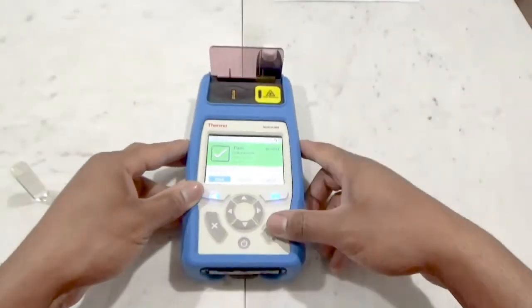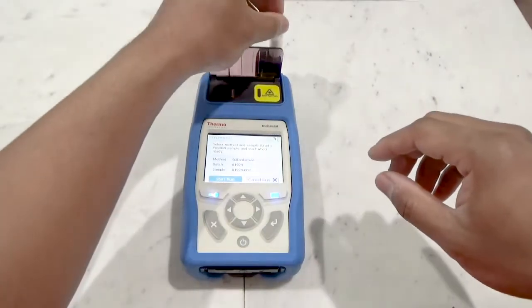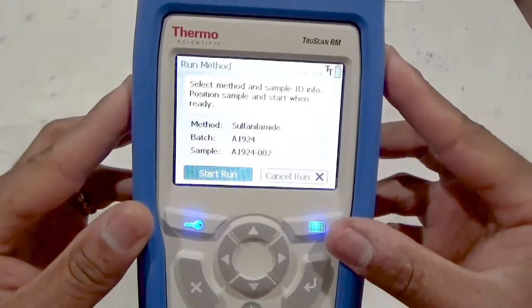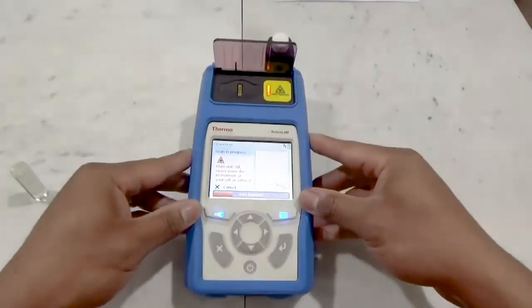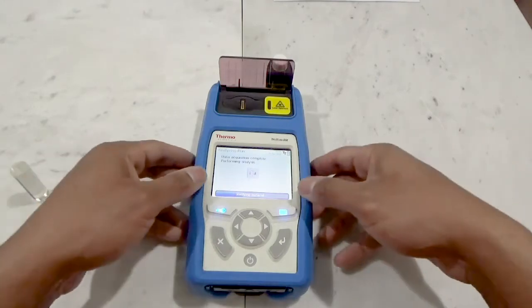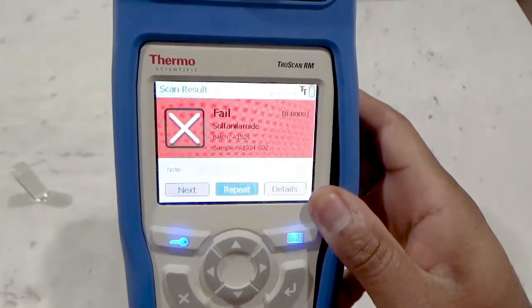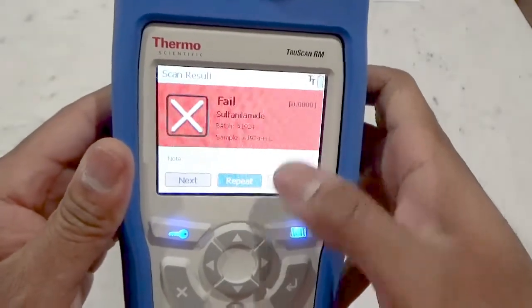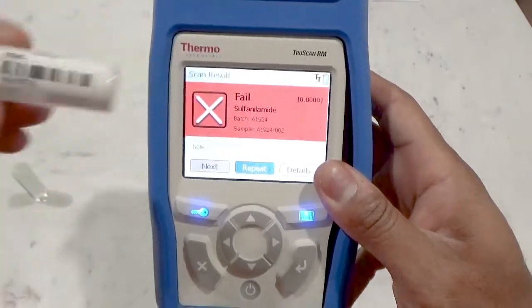Let's run a second sample of the same material. Select next and you'll note the method and batch information is the same, but the sample ID has been increased by one to reflect our second sample. Seat the sample, ensure start-run is highlighted, then press the enter button to begin analysis. Once completed, the sample spectra is analyzed and the result is noted. Here we get a fail result, and our p-value of 0 indicates that this is indeed not the correct material. With a little investigation, we indeed see this is not the correct material.